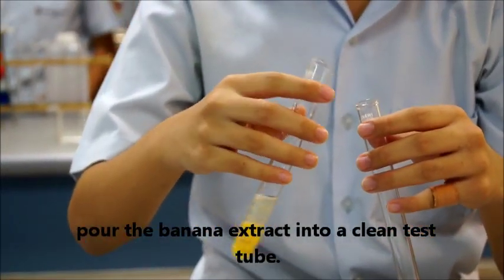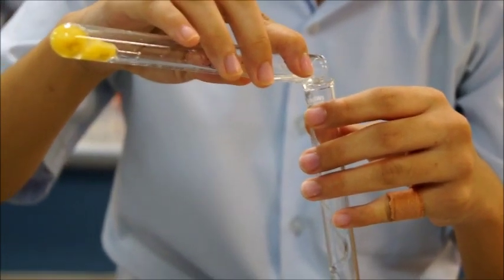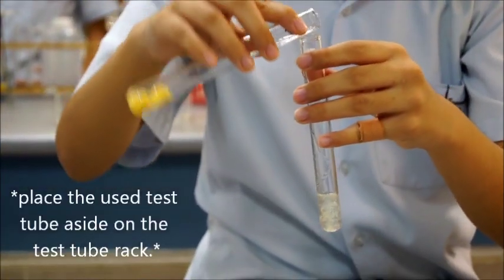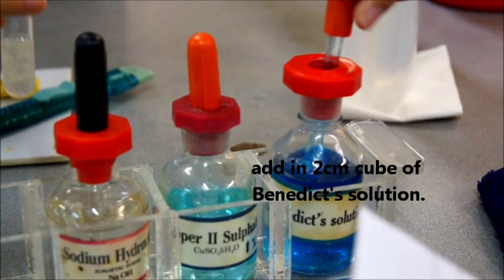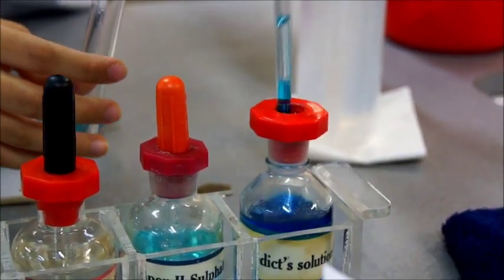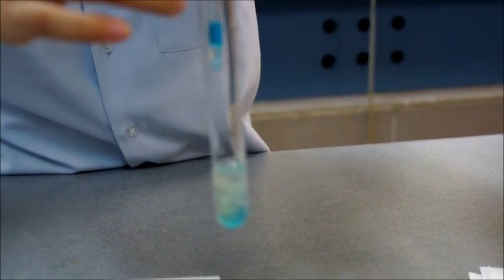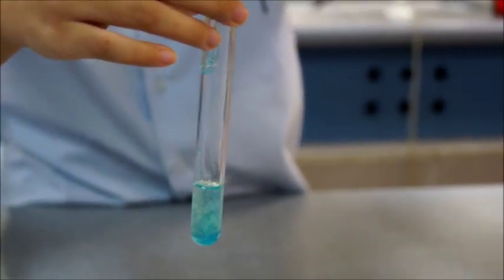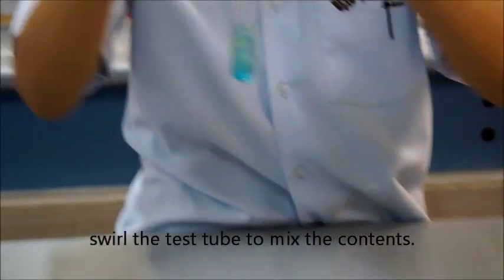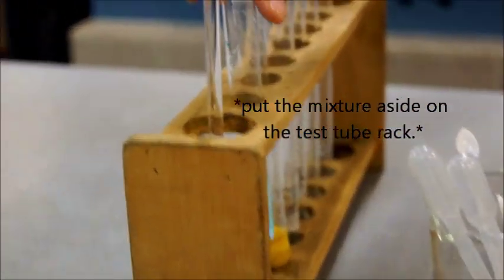Pour the banana extract into a clean test tube. Place the used test tube aside on the test tube rack. Add in 2 cm³ of Benedict's Solution and swirl the test tube to mix the contents. Put the mixture aside on the test tube rack.